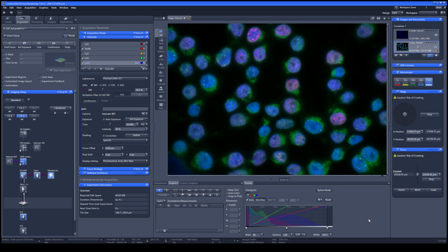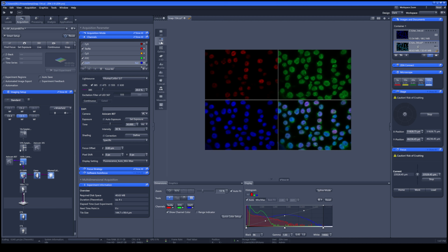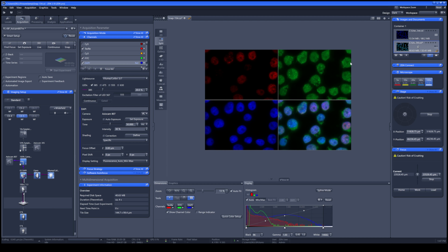The image you can further process and enhance some of the brightness of your sample by clicking each of the channels. You can either cut out the background of your image by scrolling this panel to the right, or make it brighter by moving it to the left-hand side.